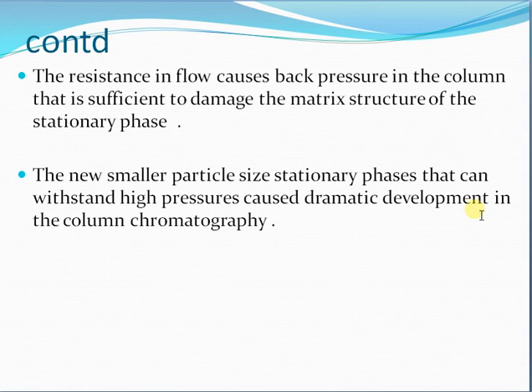The resistance to flow causes back pressure in the column, sufficient to damage the matrix structure of the stationary phase. Smaller particle size stationary phases that can withstand high pressures caused dramatic development in column chromatography.